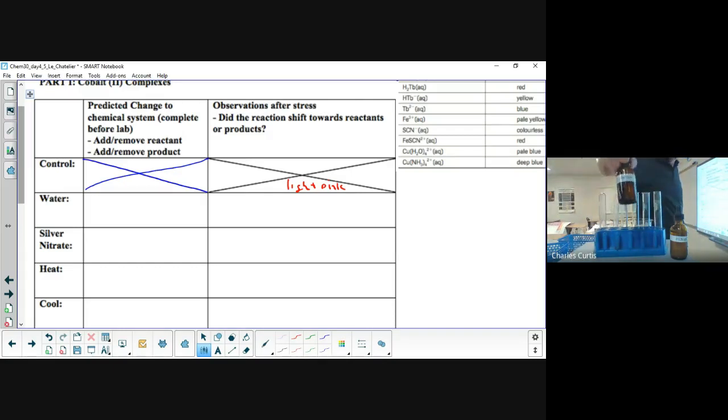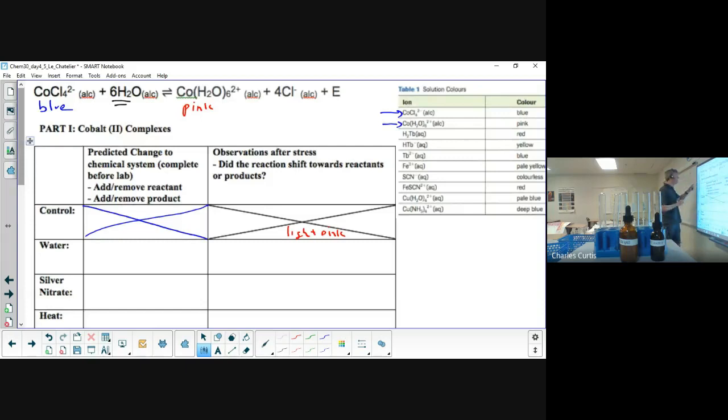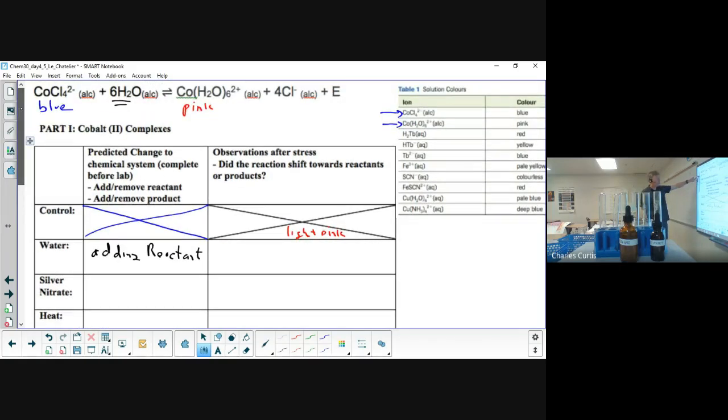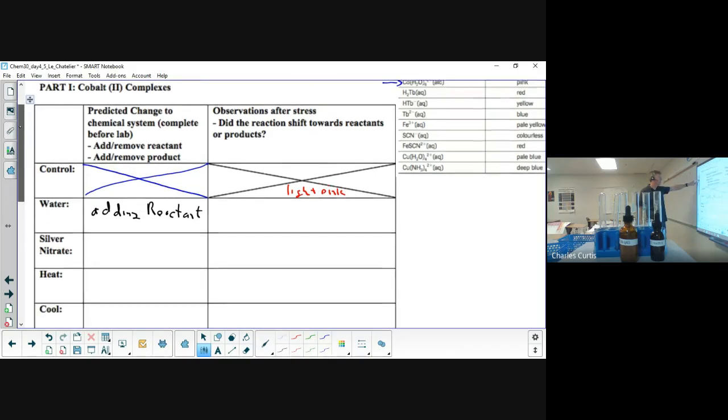So I have a dropper bottle with distilled water. So that'll be first. When we add water, in terms of Le Chatelier's principle and what stress we're doing, water is a reactant. So this stress is going to be adding reactant. And we're going to see what happens when you add a reactant. Does it cause the reaction to shift forward, where we would see pink, shift backwards, where we would see blue, or if nothing happens, it would stay the color of the control.